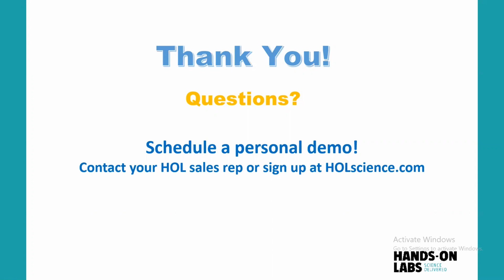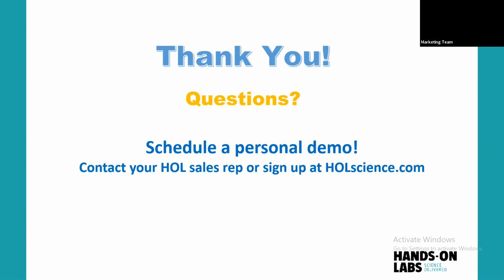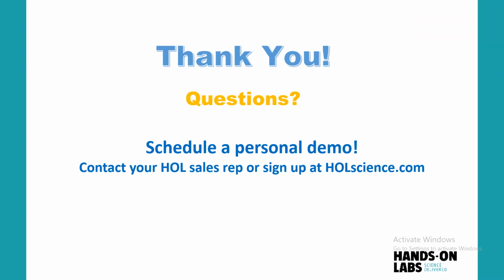Here's another good question. Does the kit have extra supplies if the students happen to mess up an experiment? In general, yes. There are some experiments that may not be able to be repeated, but certainly if we're talking about chemistry and the GOB type experiments, almost always there are more chemicals in each of those pipettes than are called for in a particular procedure. So should a student make a mistake, they're easily able to repeat that procedure. Wonderful.